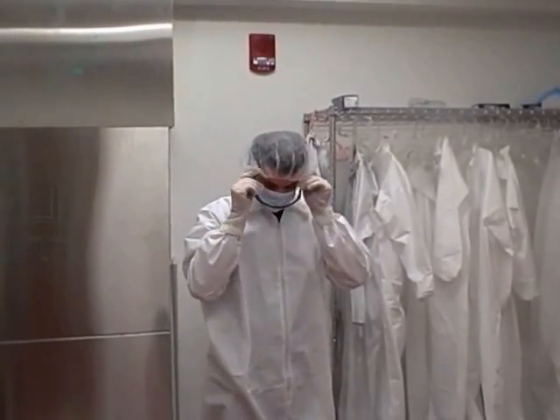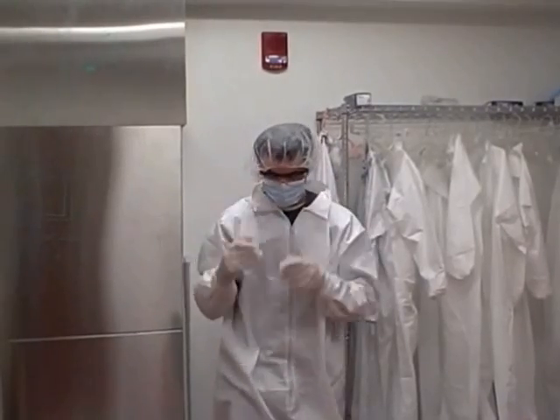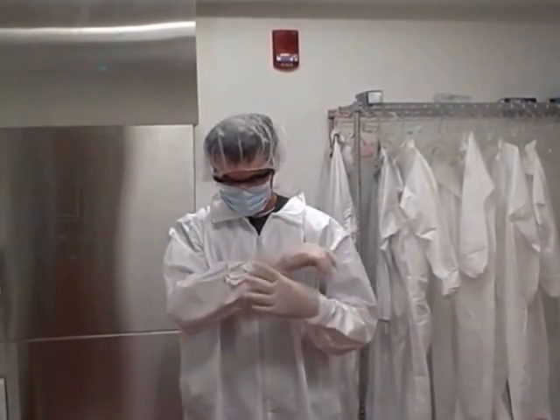Put on eye protection. Double check your gloves and make sure the sleeves are tucked in. You are now ready to walk into the clean room.